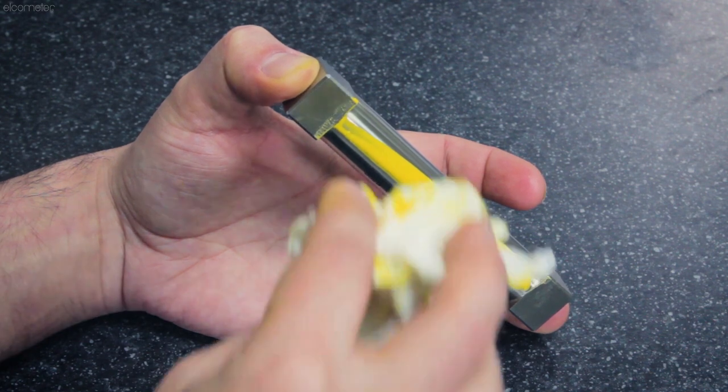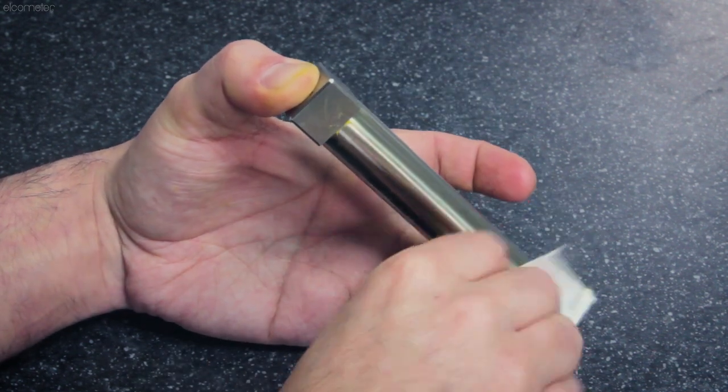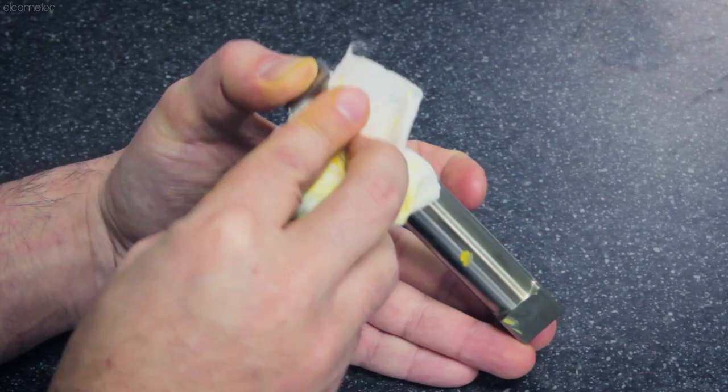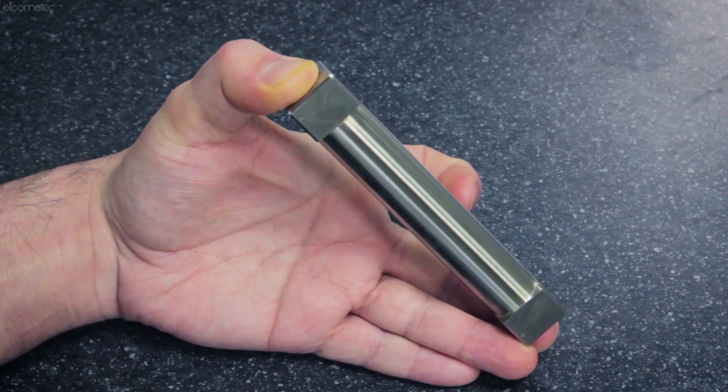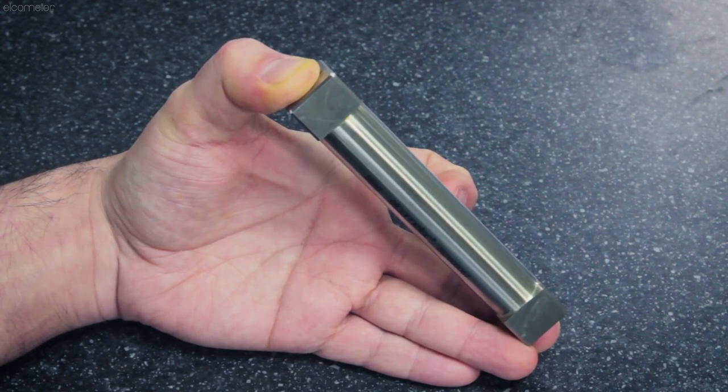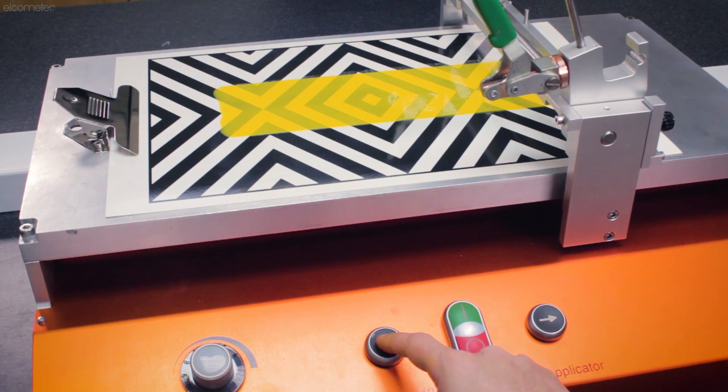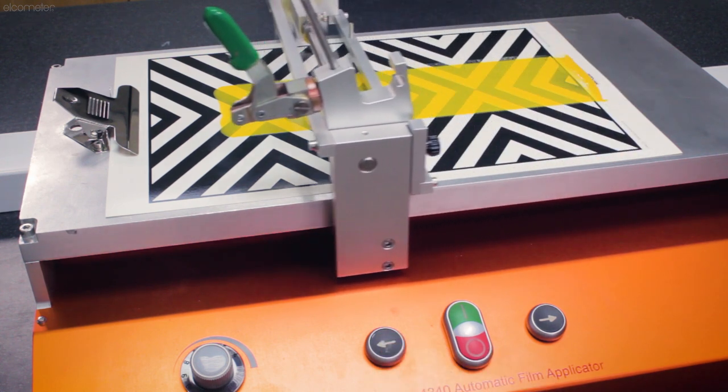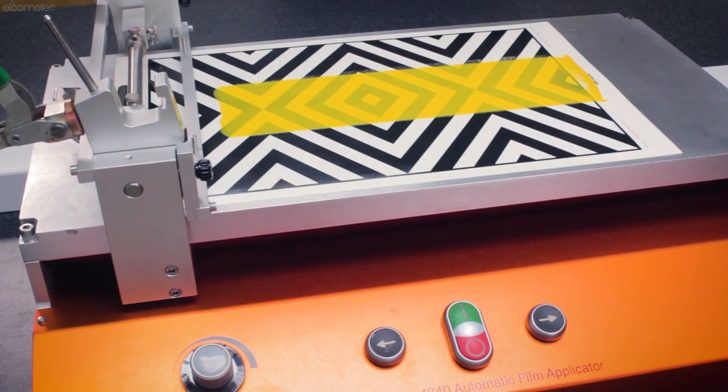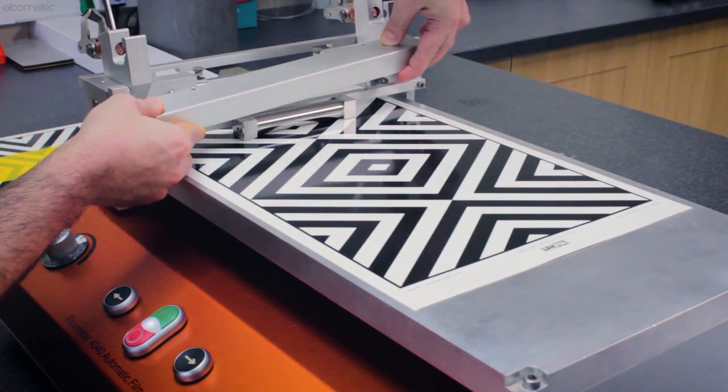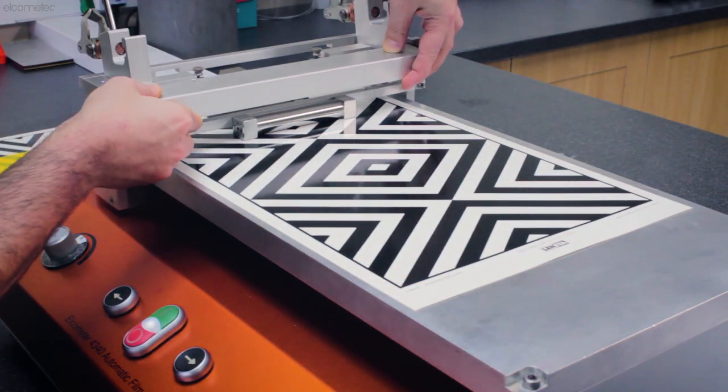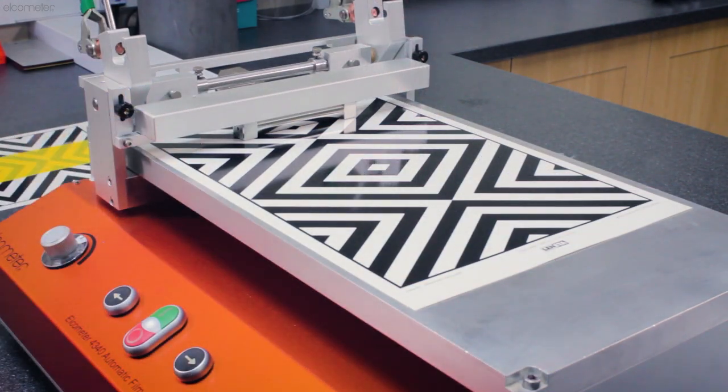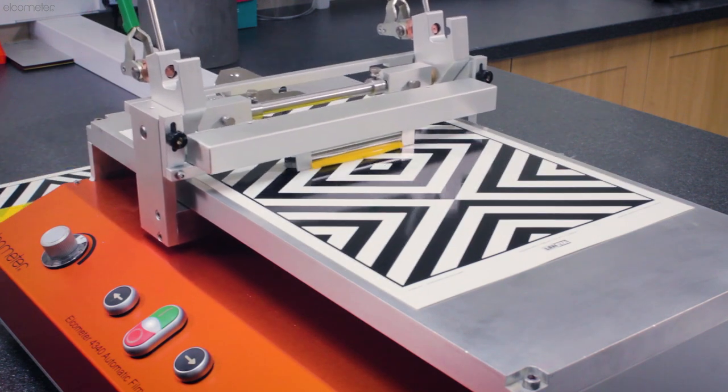You should also clean your chosen applicator as soon as the film has been created to avoid your product drying onto the applicator, which could affect its performance. Then press the carriage return button and you have your completed film. Simply repeat this process as many times as required, with the Elcometer 4340 ensuring you get the same film every time, allowing for consistent, comparable testing.